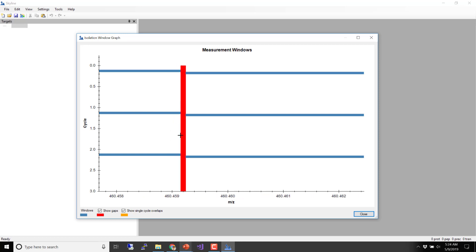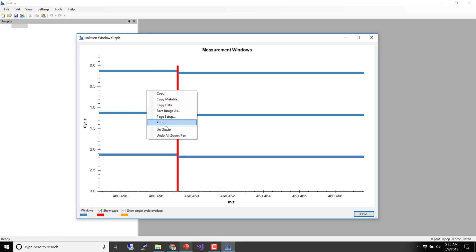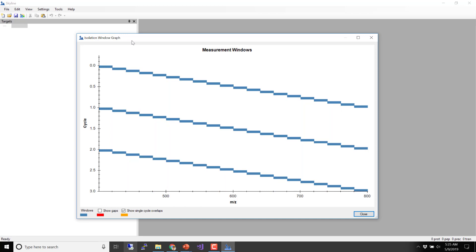The windows are basically 20 m/z. You can click the graph to see them. They're 20 m/z and there are actually tiny gaps between them — but they're really tiny. You can see that even when I zoom way in, I have to get into the hundreds, even thousands of an m/z to see them. There are these little tiny gaps between windows, but they are placed in optimal locations so that charge 2 and 3 peptides really are as far away from those boundaries as possible.